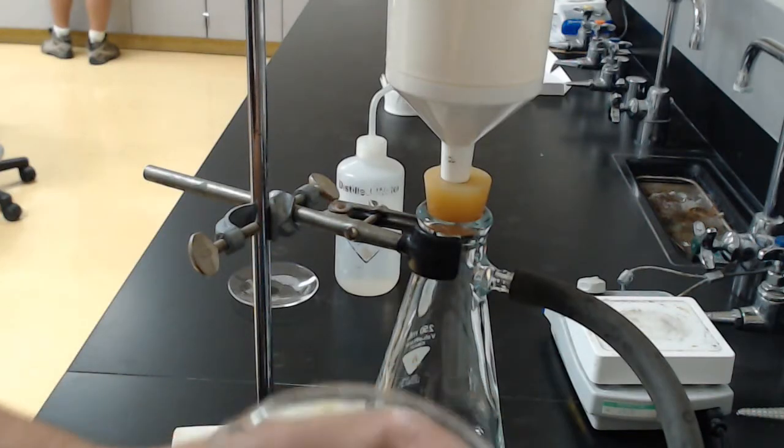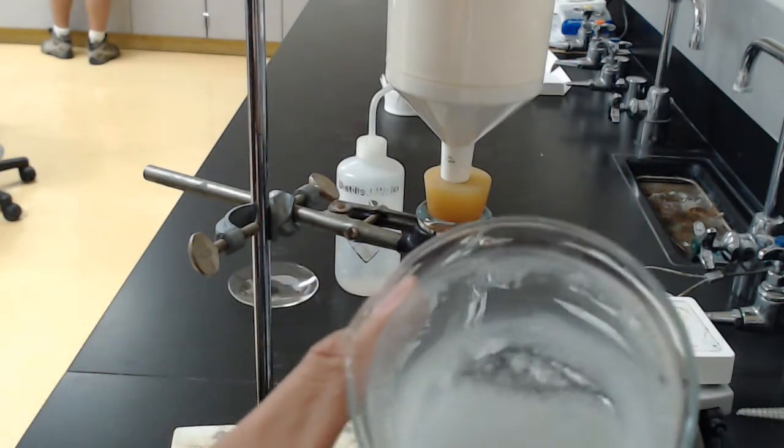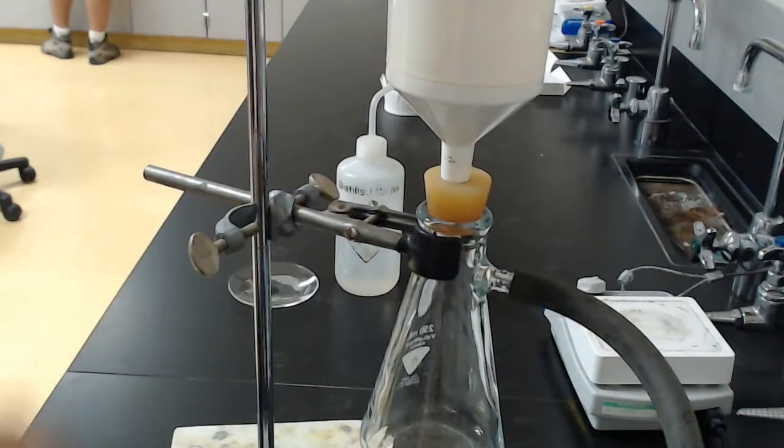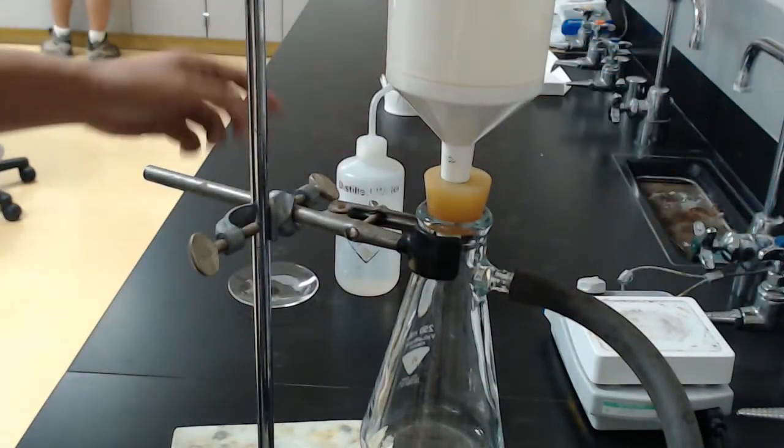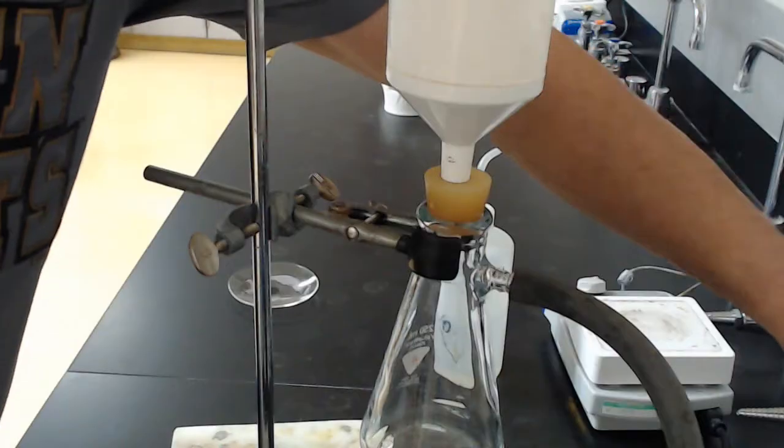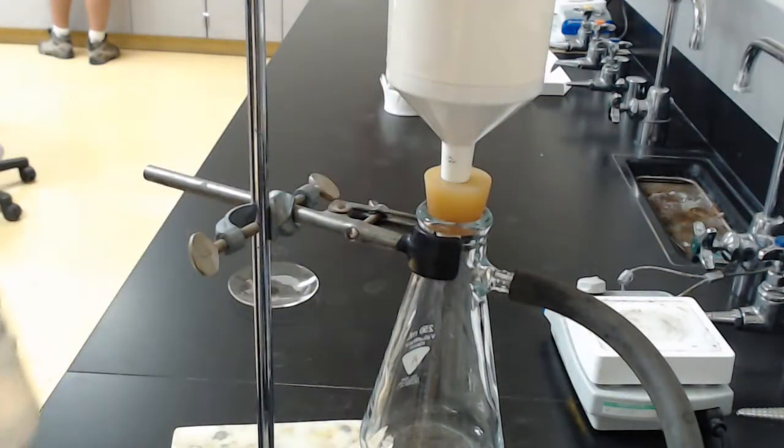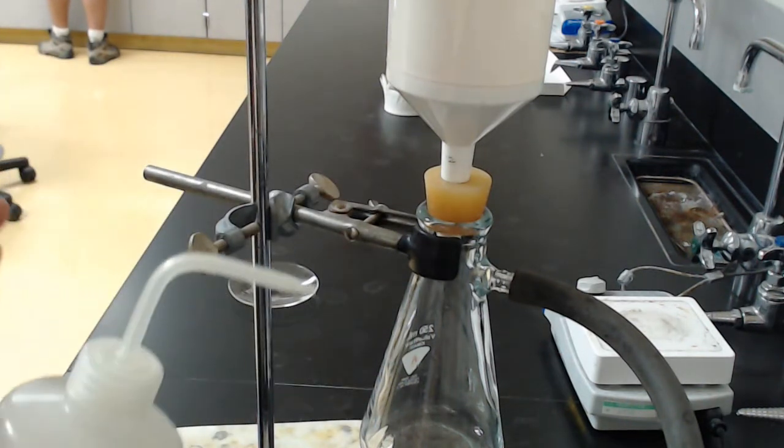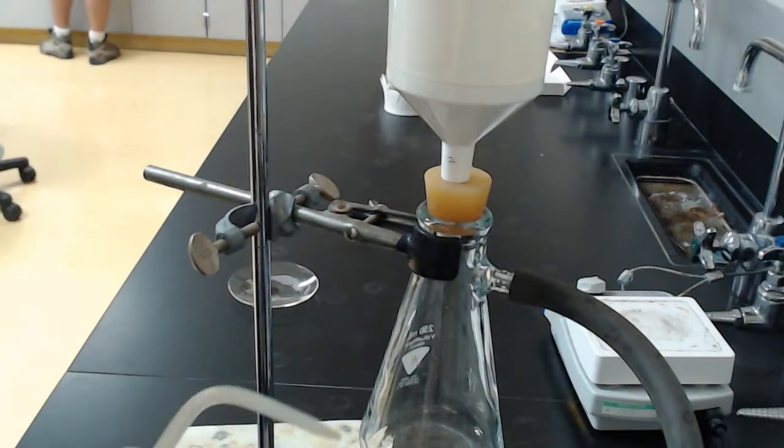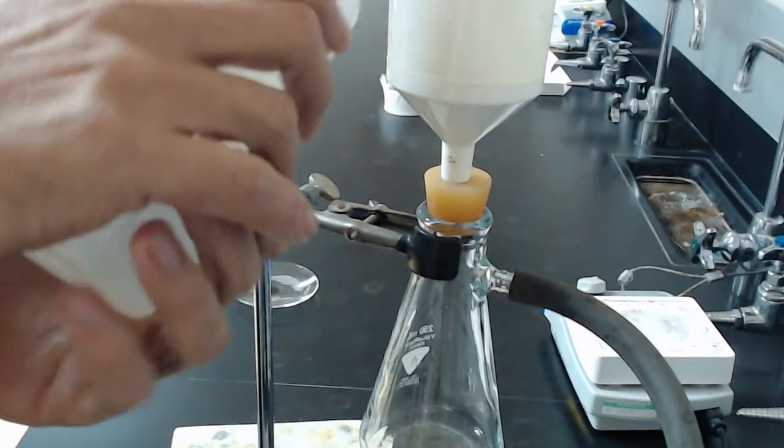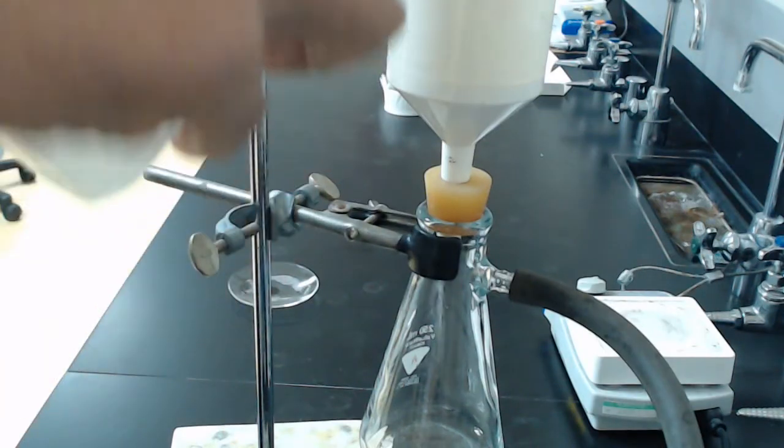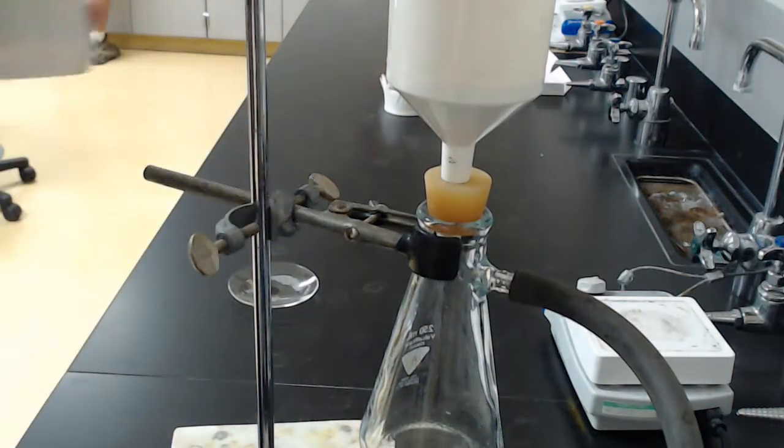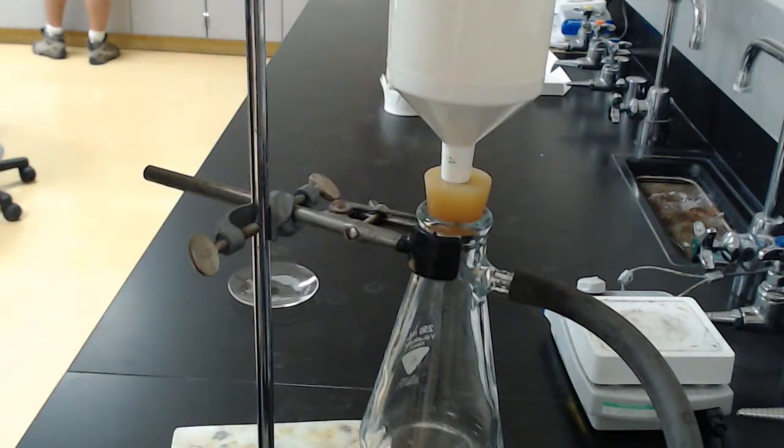Alright, looks like we are ready to filter this now. Take a look at how it looks. See it in there. Alright, so I have all this hooked up here. Just a vacuum line. I recommend that you start it and then get it wet with some water. So, the solvent you want to wet with is not always water. You guys probably learned to wet it with water, but typically in organic chemistry, you want to wet it with whatever solvent you are using. We just happen to be using water today, so it's fine. But there are labs later on where you want to use things like ethanol or ether. It all depends on what your solvent is. And in certain organic processes, adding water can destroy everything. So, right now it's fine, but it's not always fine.